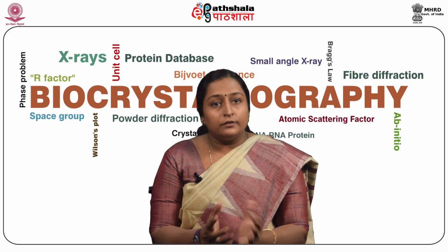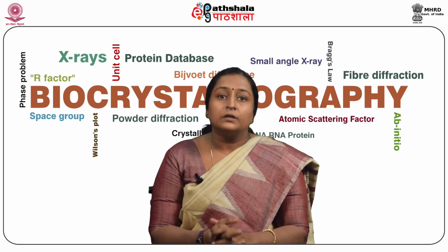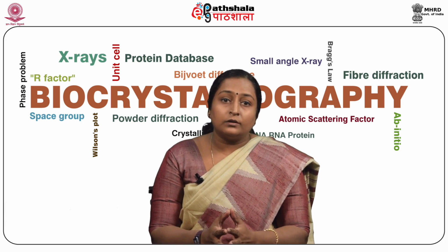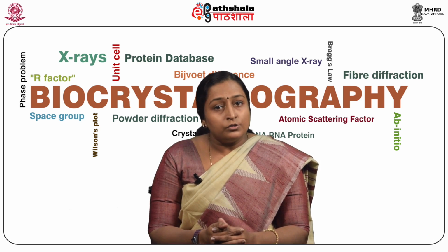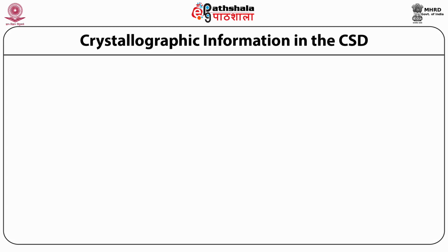The following are the different information that is available in the CSD, like the compound name, chemical formula, chemical diagram, the property, the absolute configuration, the conformers, isomers, etc. Moving on to the text information, it contains details about disorders, whether any are present, the residual errors, the non-standard experimental conditions, and also about polymorphism and so on. CSD is continuously updated with new structures. In addition to searching published crystal structures, one can also build their own local structure repositories that are then searchable either independently or in conjunction with the CSD.